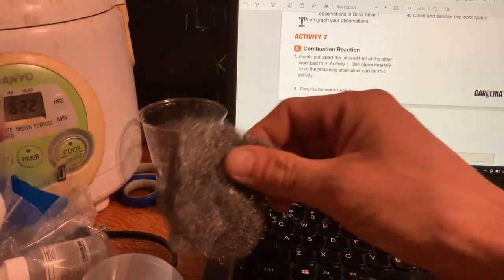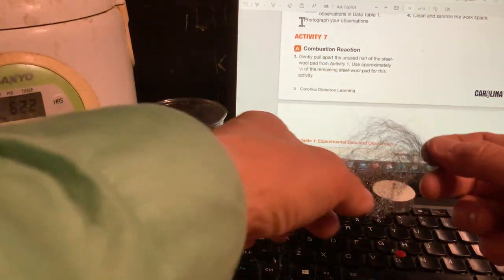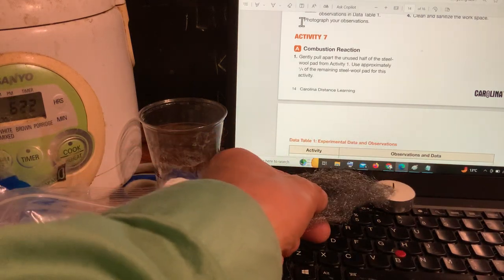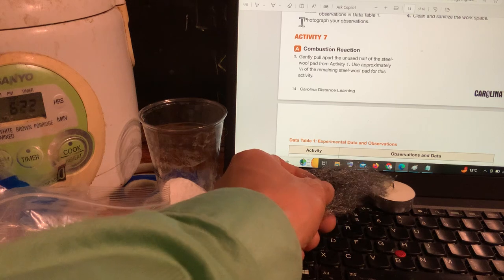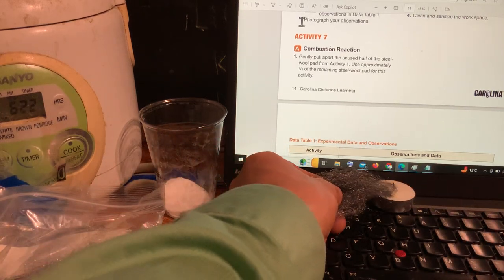The critical part of activity 7 is you got to use just a little bit, just like this much, even less than this, you know? You just have to get a little bit. It's not going to go on fire. It's not going to be a flame. You're just gonna get some glowiness, and you're gonna have to be pretty fast with your photo.